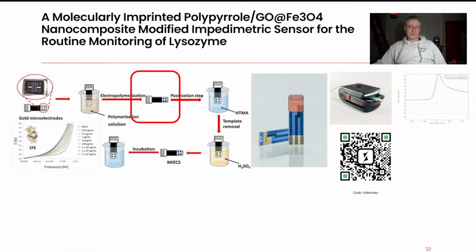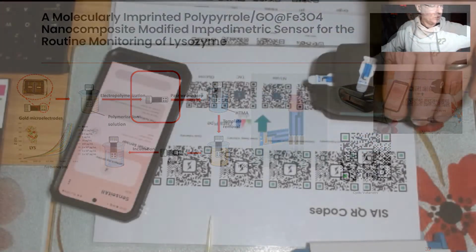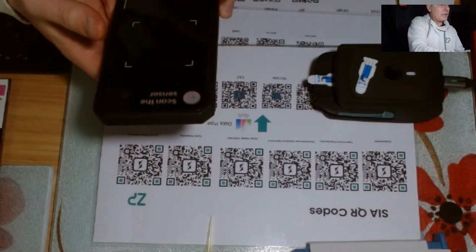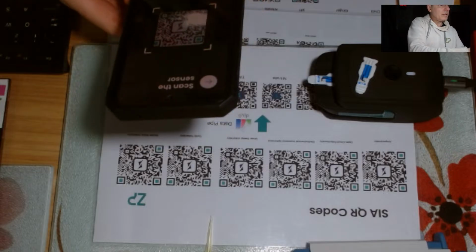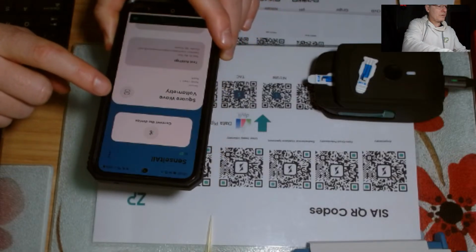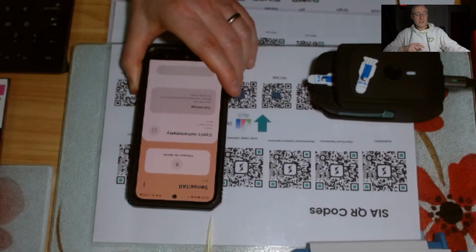I was just showing here that, in fact, this very new type of potentiostat, the Sensi-All potentiostat, does have cyclic voltammetry in its arsenal as well. So we can quite easily scan, whoops a daisy, that's square wave as well, because I scanned that QR code, linear sweep there, I want to get that one there, square wave. I've got them all too close to one another. I'm just doing this for a bit of fun now. There we are, cyclic voltammetry.